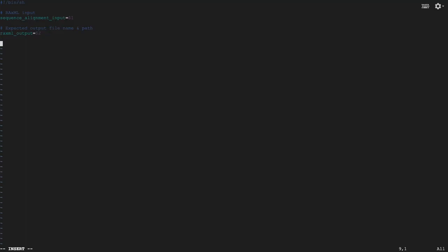And just like with ivar and maft, since we're using the singularity image, we want to make sure that we make the working directory that temp directory that CLC Genomics Server sets up when running these tools. So we're going to make this and comment it first: change to CLC Genomics Server external app temp directory. We can grab the temp directory name using dirname of that second positional argument. Then we'll just change to that temp directory.